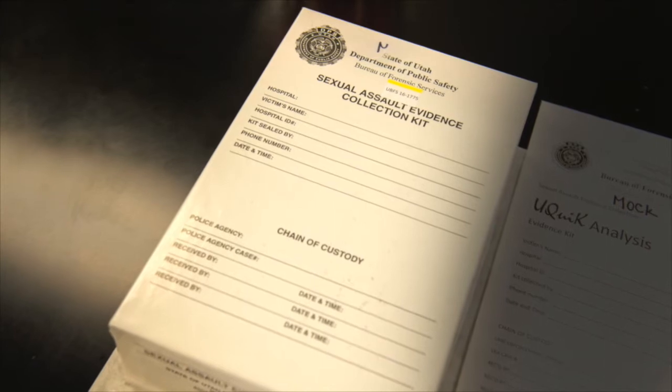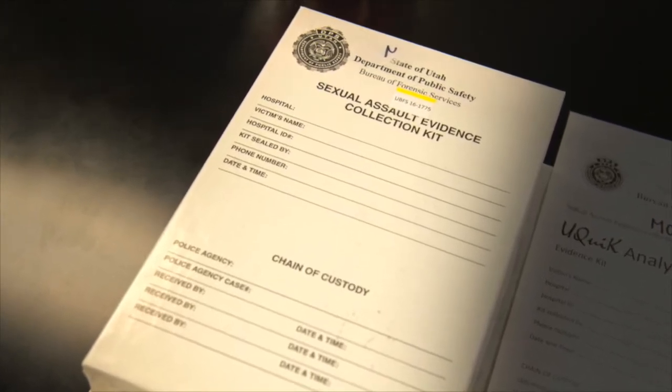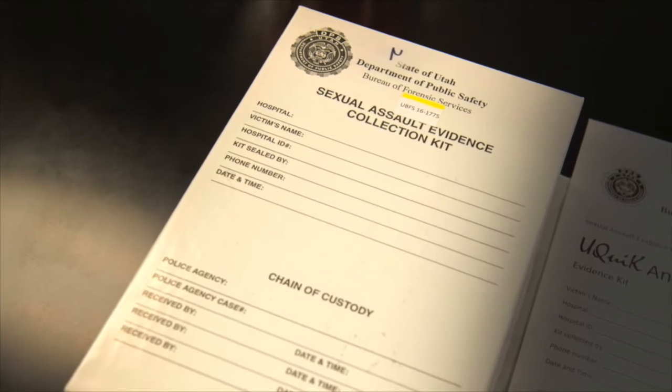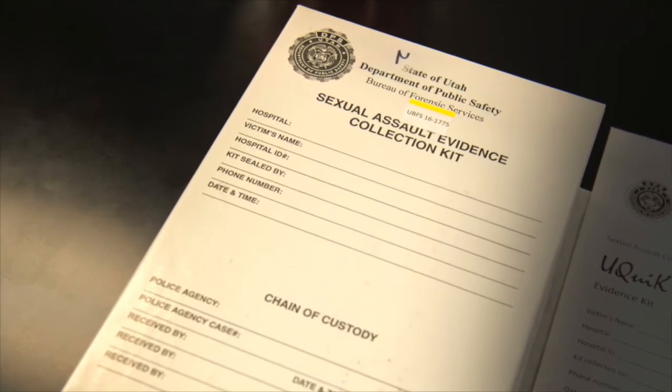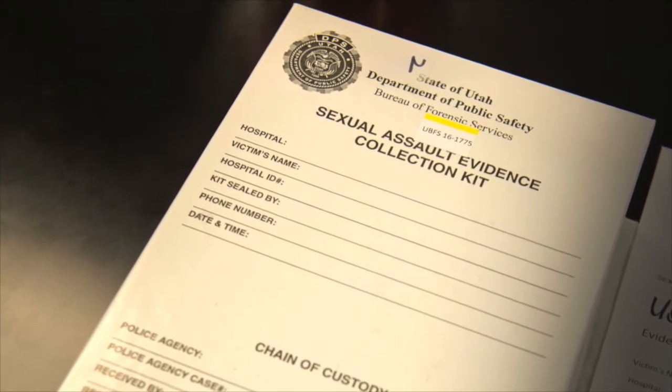The Sexual Assault Examination Kit, better known as a Rape Kit. The backlogs in testing these little white boxes have been making headlines. But state crime lab officials say many people don't understand what goes into examining the kits for potential DNA evidence.